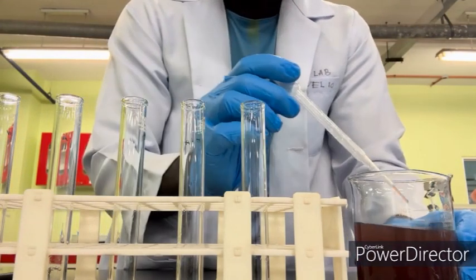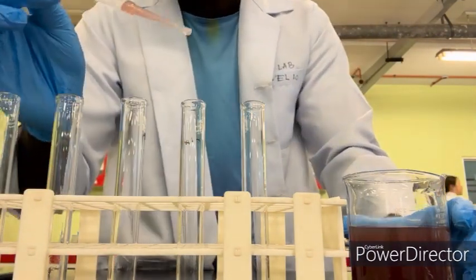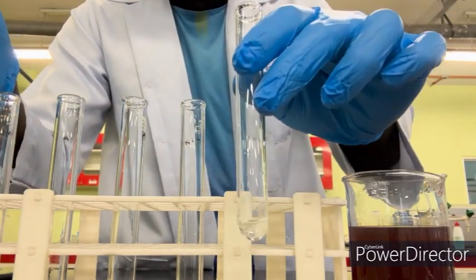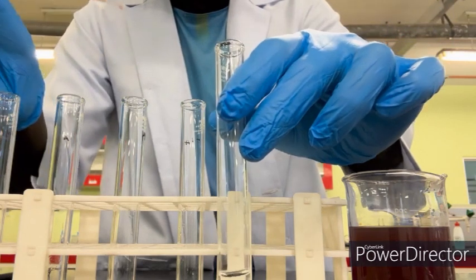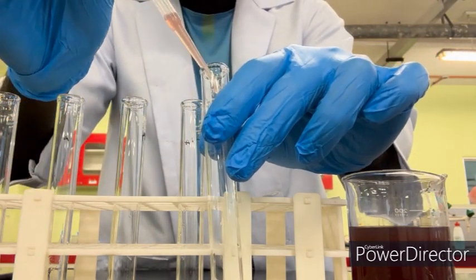Okay, so now this one is a droplet. Now this is distilled water, and we're going to add a few drops here.